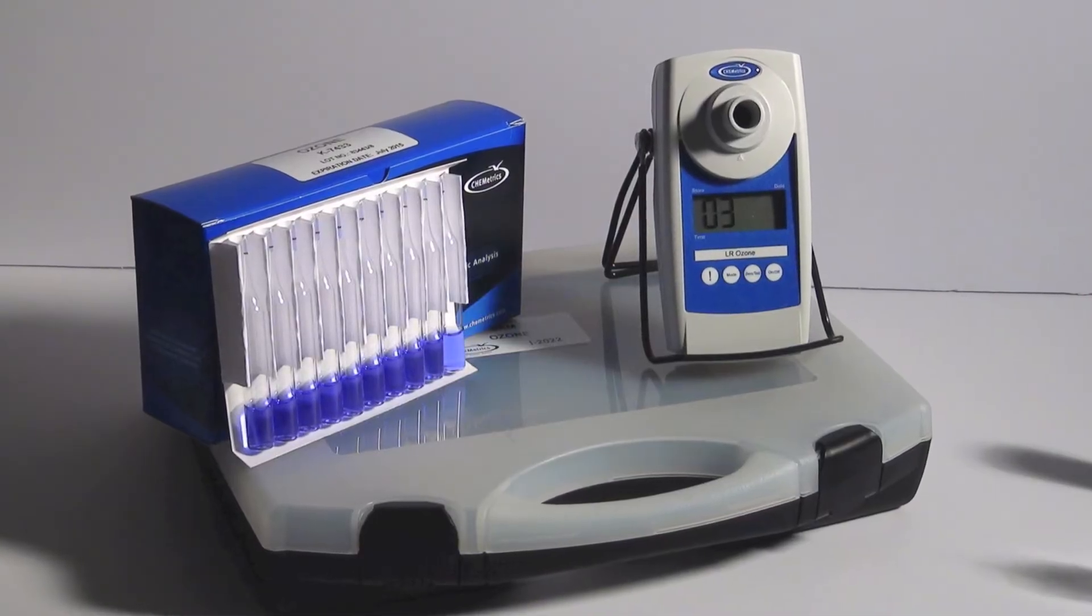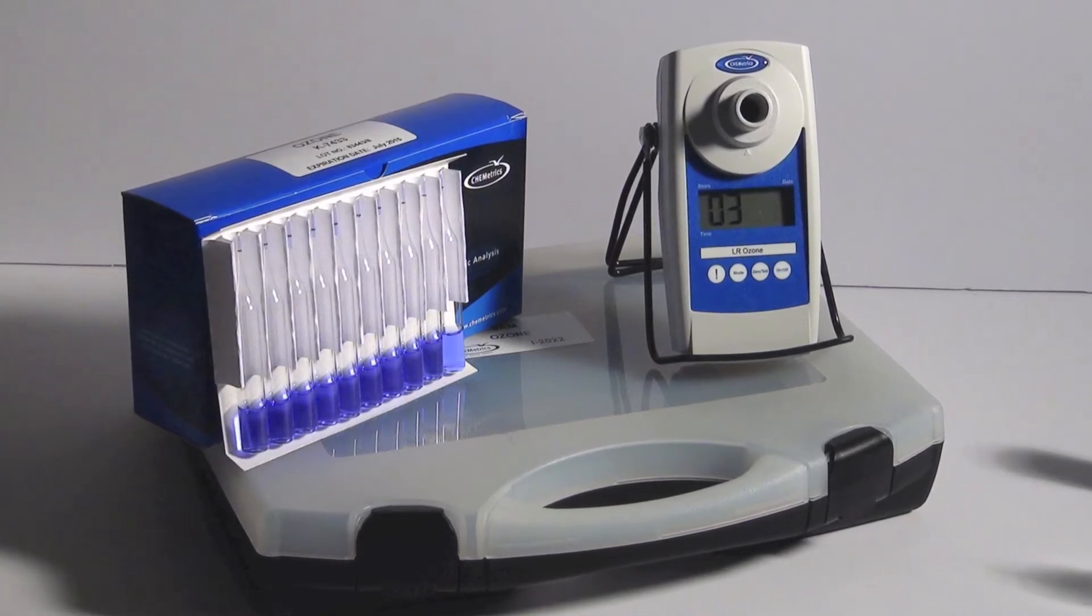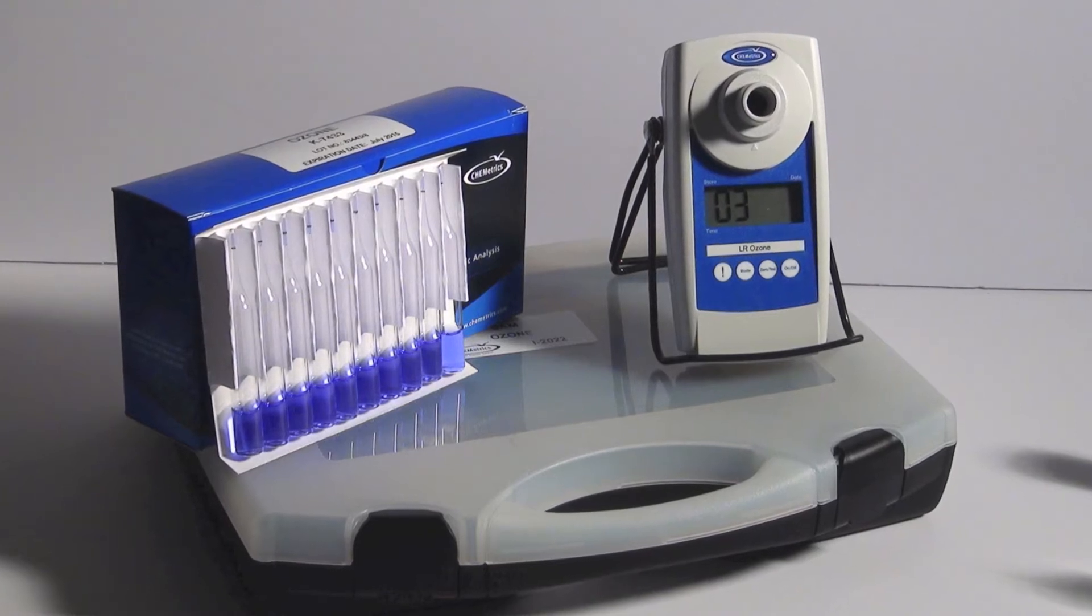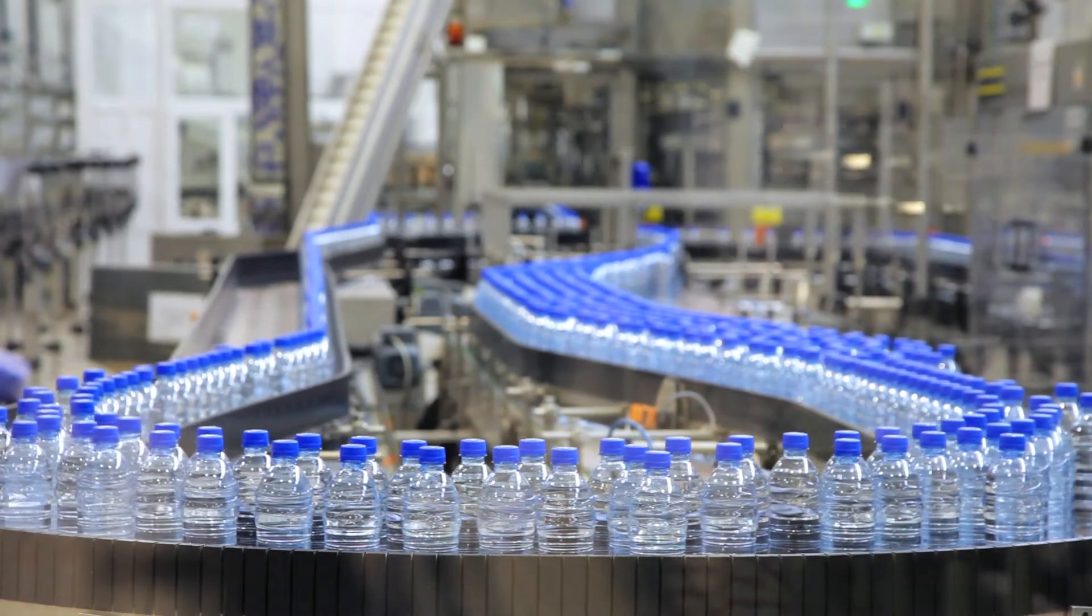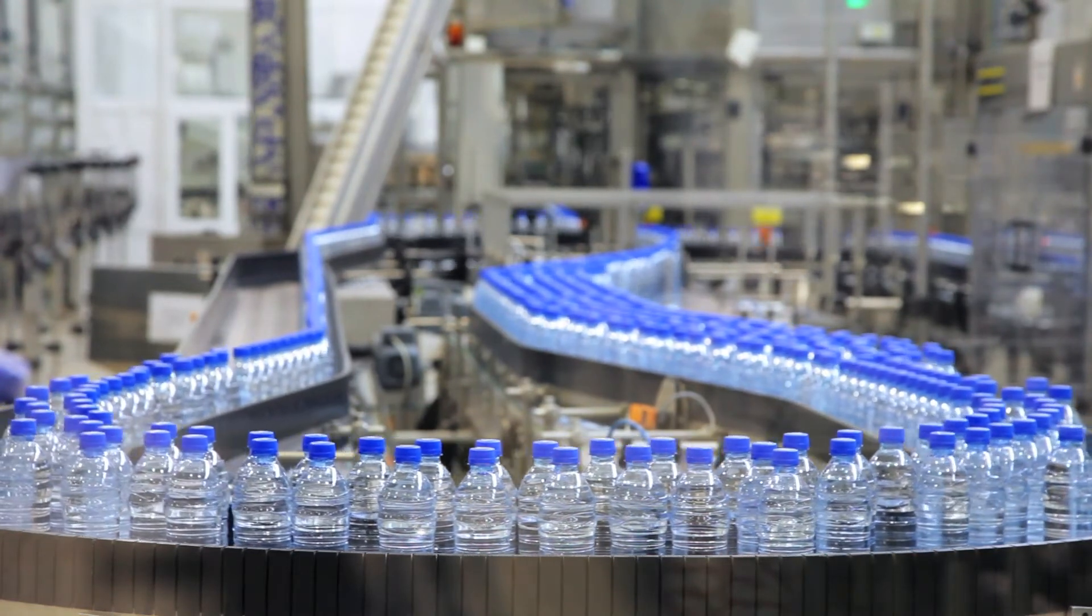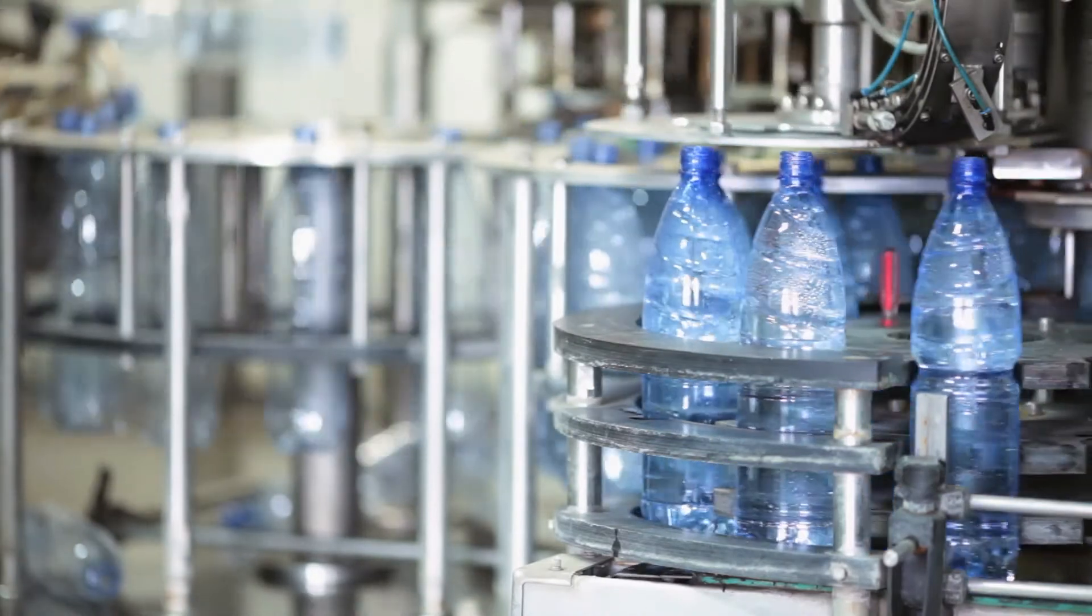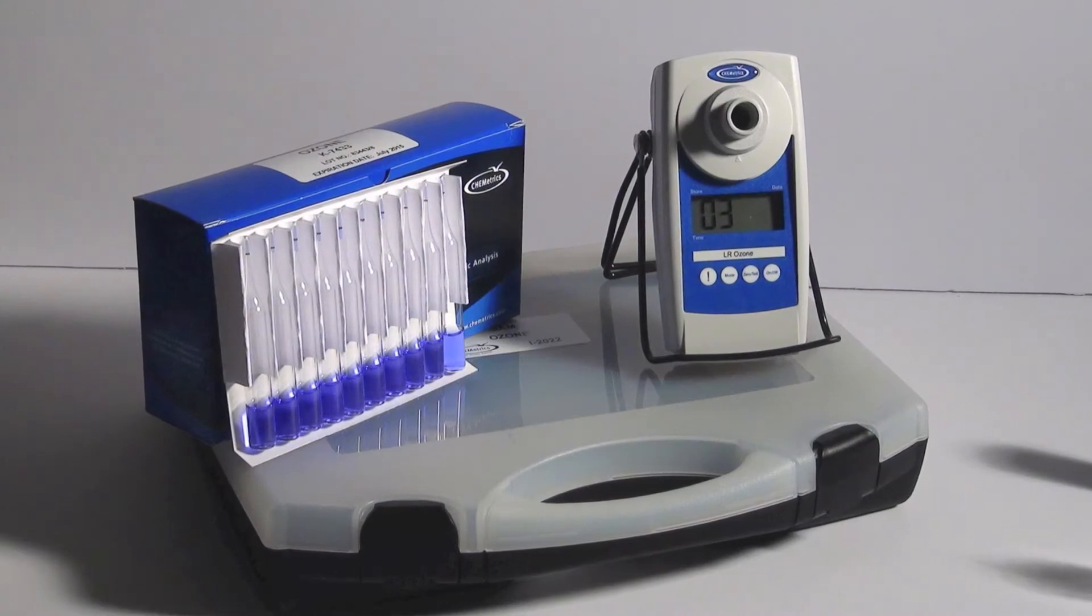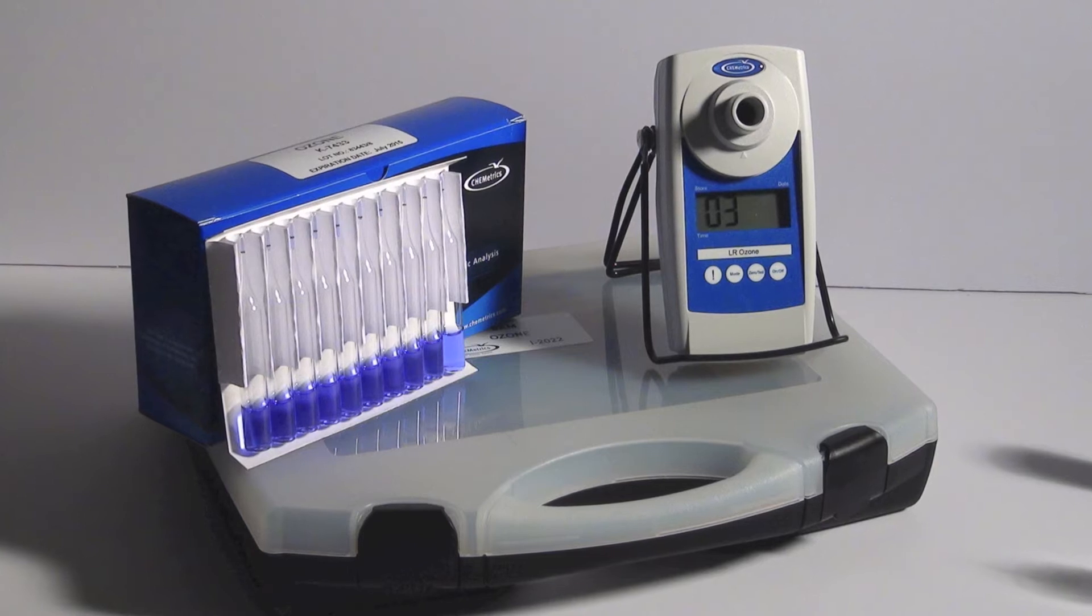Kemetrics K-7433 Ozone Vacuvials Test Kit employs the broadly accepted indigo colorimetric chemistry packaged in vacuum-sealed self-filling ampoules. Designed to quickly and accurately measure ozone levels following disinfection treatment, the kit meets FDA control point requirements for bottled water. It features an innovative self-zeroing technology that eliminates the need to generate a reagent blank, using only one ampoule per test.